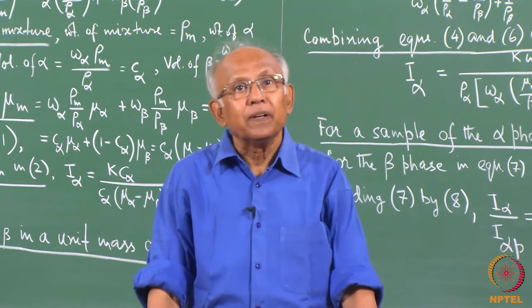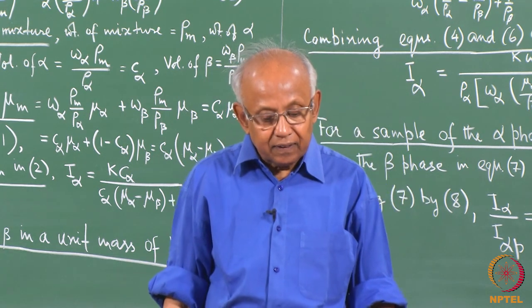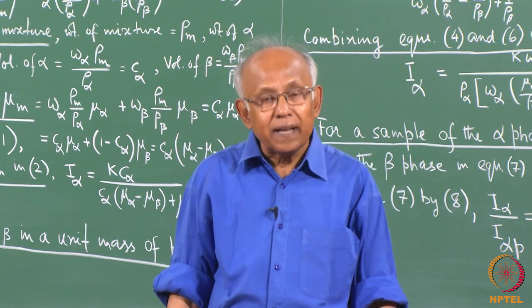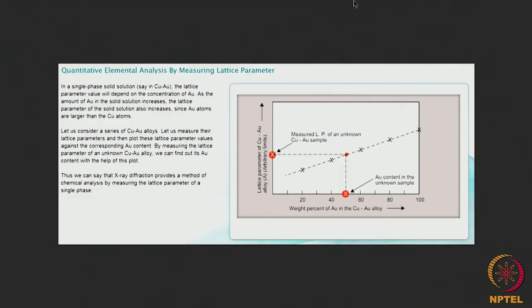Say, for example, we have got a single phase solid solution of gold in copper. The lattice parameter value will depend on the concentration of gold in the alloy. As the amount of gold in the solid solution increases, we expect that the lattice parameter of the solid solution will also increase, since the gold atoms are larger than the copper atoms.